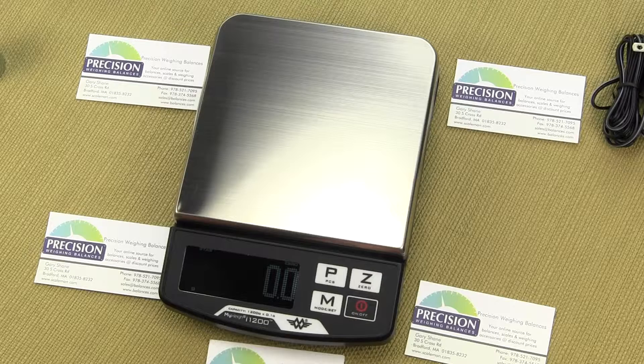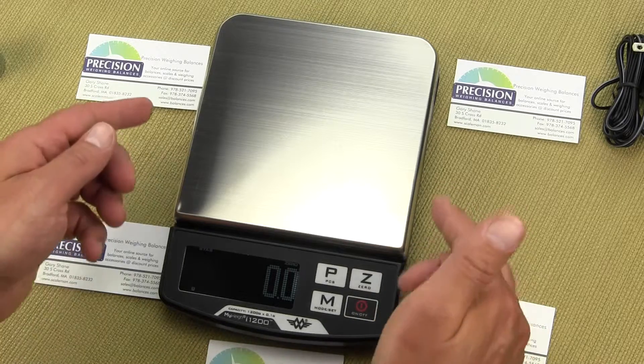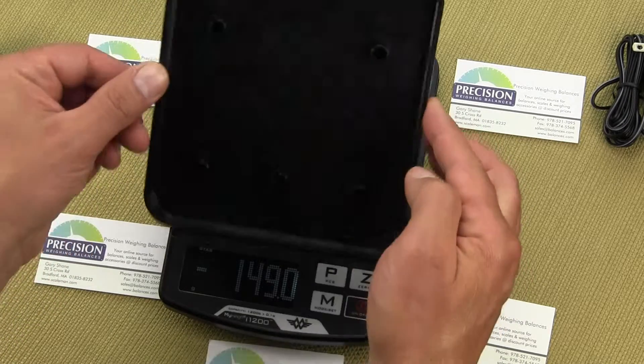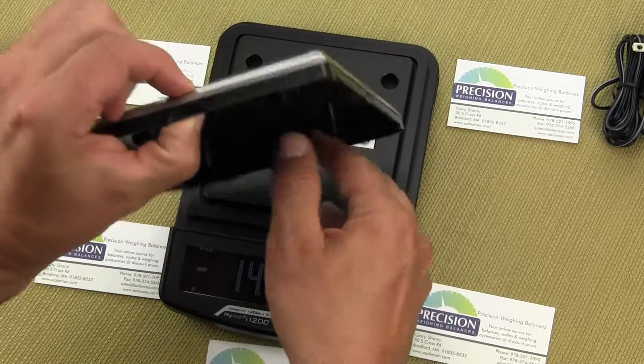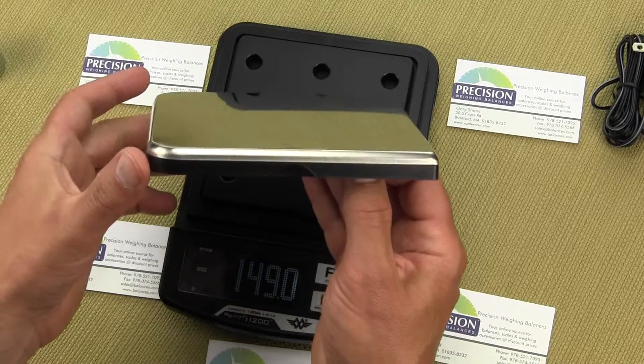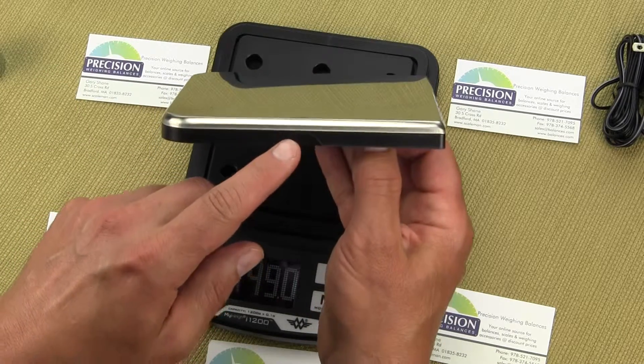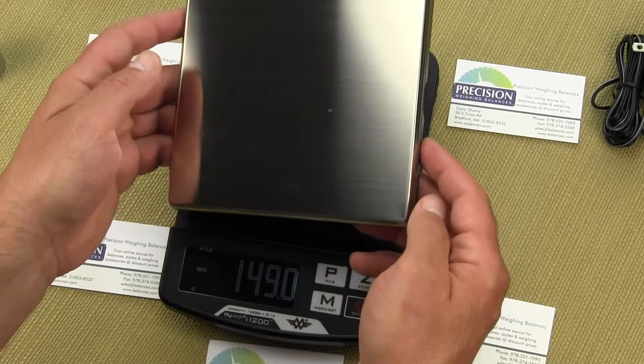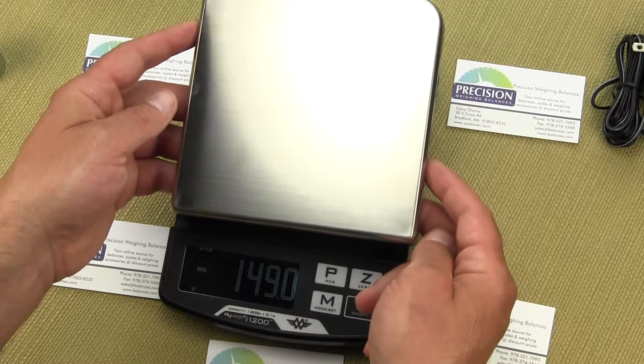The balance has a nice large stainless steel platform that is removable. The platform even has little divots on the side for your thumb, so MyWay has thought of everything when designing this scale.